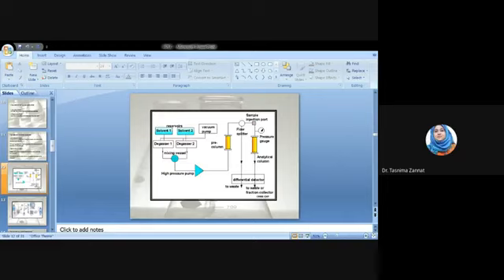The mobile phase acts as a carrier to the sample solution, and as we know from the previous discussion of the chromatographic technique like TLC and PC, mobile phase is the carrier of the sample solution. And a sample solution is injected into the mobile phase through the injector port. ইনজেকশনের মাধ্যমে এটাকে পোর্ট করা হয়, আমরা ভিডিওতে দেখব। As a sample solution flows through a column with the mobile phase, the components of that solution migrate according to the non-covalent interaction of the compound with the column. Here column means actually the stationary phase.